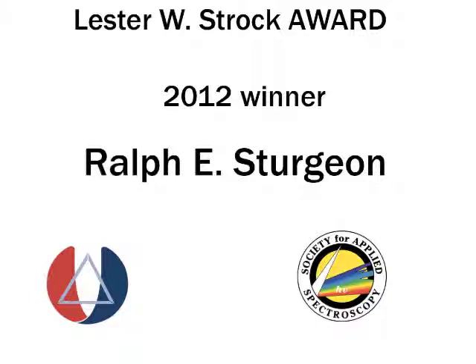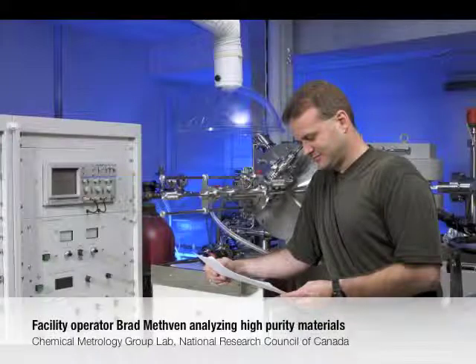Some of your recent work has focused on UV photogeneration as a sample introduction system. Can this technique be applied to the majority of elements in the periodic table? And is it a multi-element or a single-element approach?